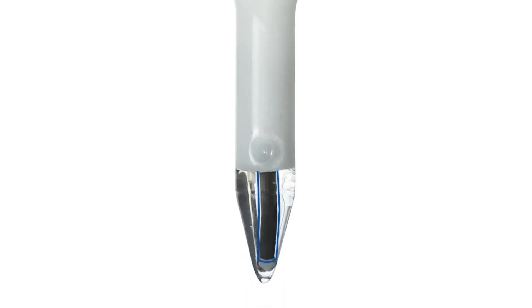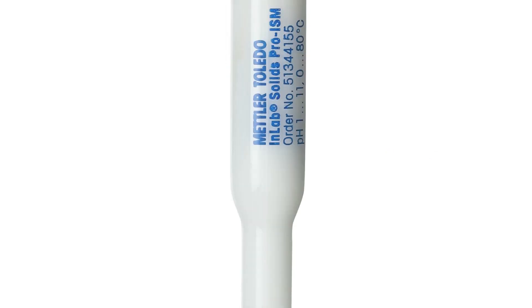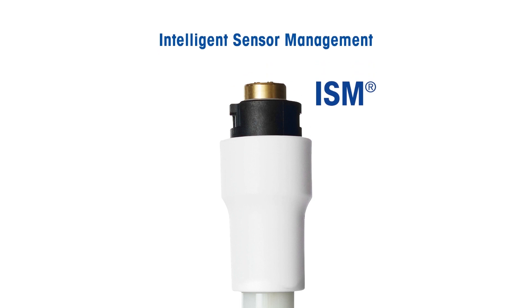This electrode has an inbuilt temperature probe. Thanks to the intelligent sensor management, the electrode's name, serial number, and calibration data is stored in the electrode itself.